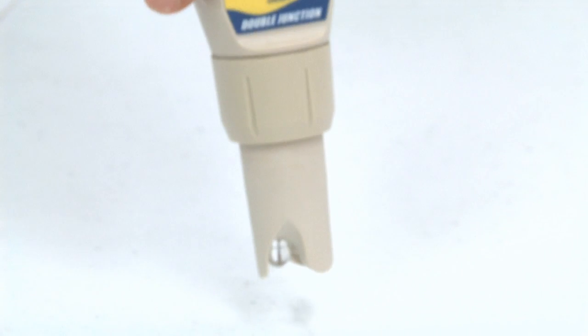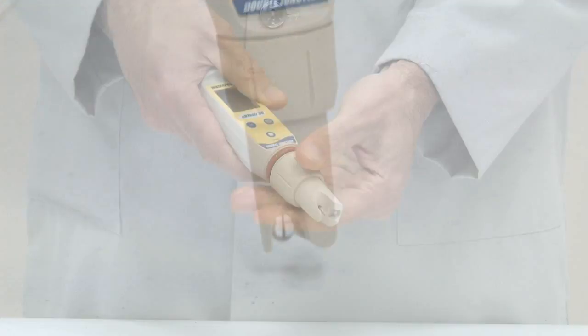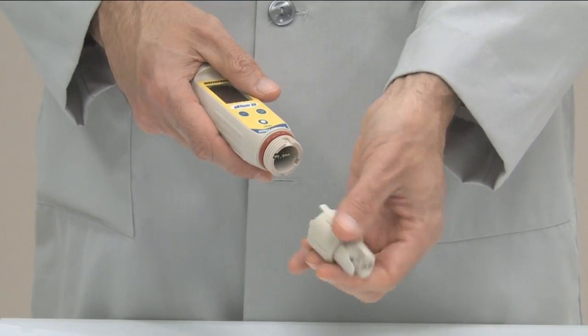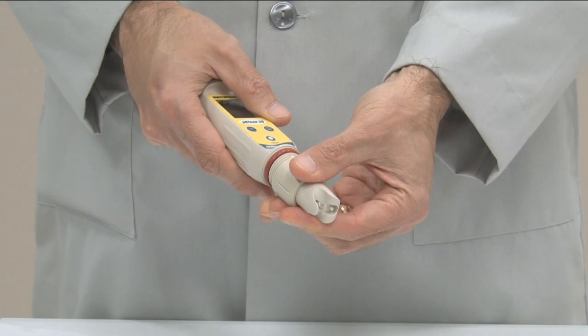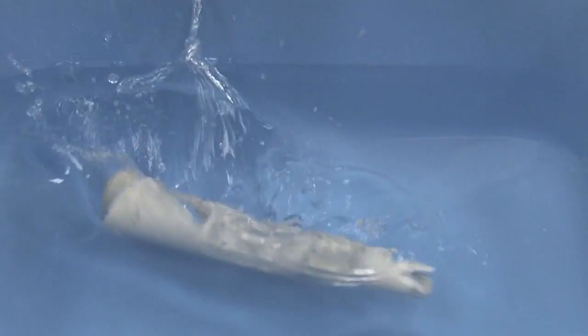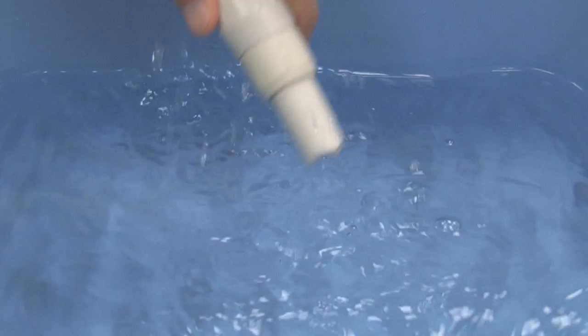A recessed design helps protect the glass bulb from breakage, and easy-to-replace modules require no tools — simply twist off and replace. The Oakton Waterproof pH testers are 100% dustproof and encased in waterproof housing. They even float for easier recovery.